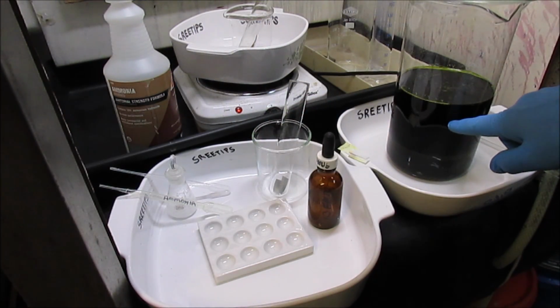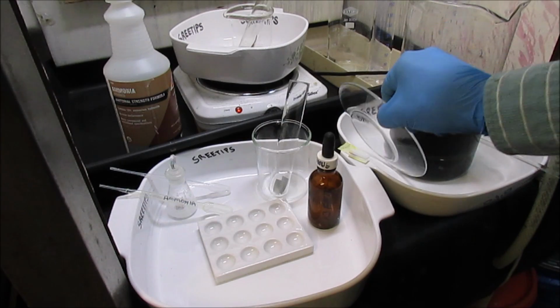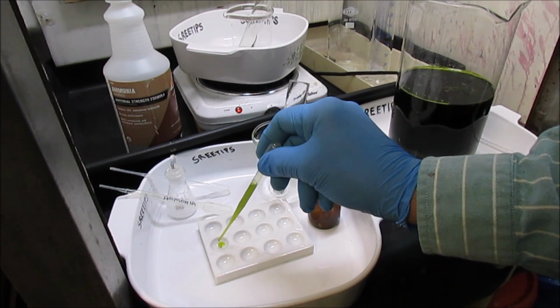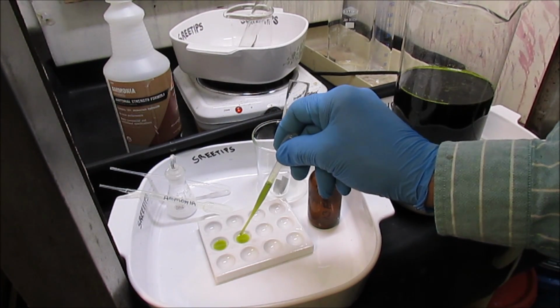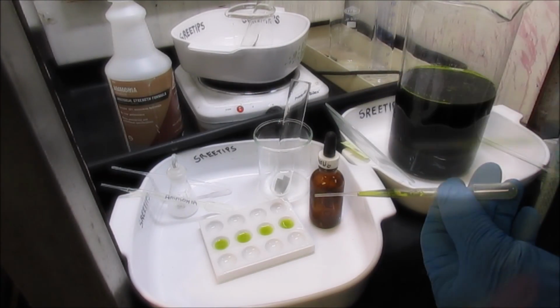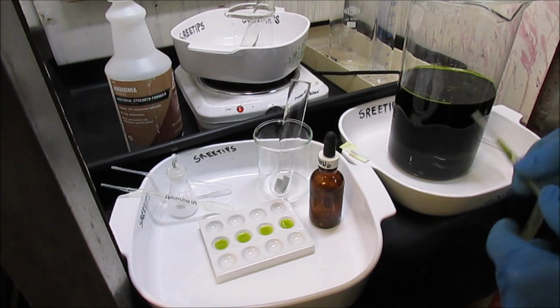Got the solution allowed to settle. It's been settling now for several hours. I'm going to get some of the solution into a pipette here. I'm going to put some drops in this spot plate. 1, 2, 3, 4, 5. Now I'm going to do some tests on the solution here.